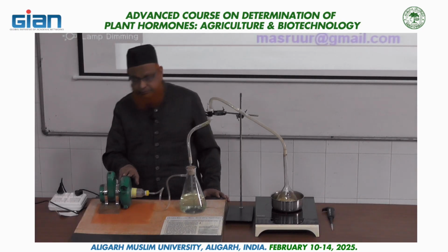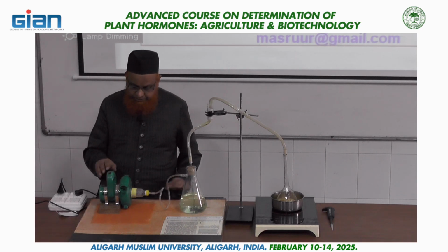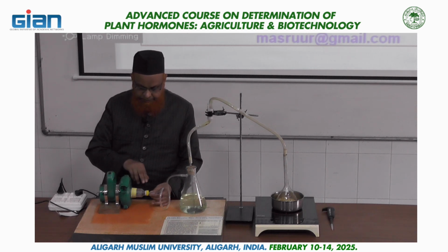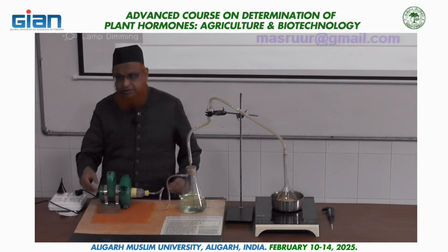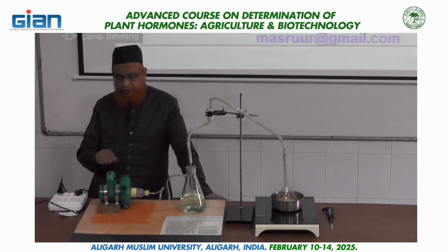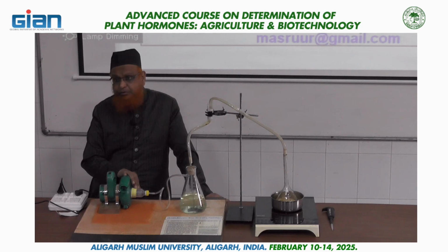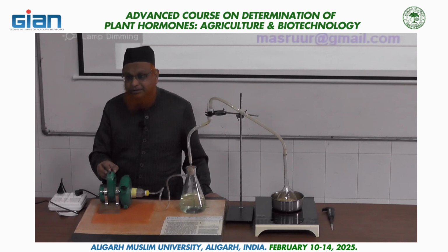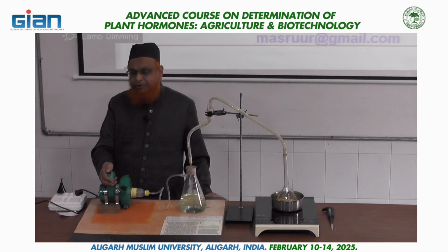Now this is the suction pump, okay? This is made in India, and this suction pump basically has a dual function. If you connect the connector to this point, it will suck the air, and if you connect the connection to this point, it will push the air, okay? So dual function. So now I am using this equipment for sucking the air as a vacuum pump, right? And the good thing is that this also contains a regulator, okay? You can control the speed also. For example, 1, 2, 3, 4, 5, 6, up to 6 levels, you can increase it.